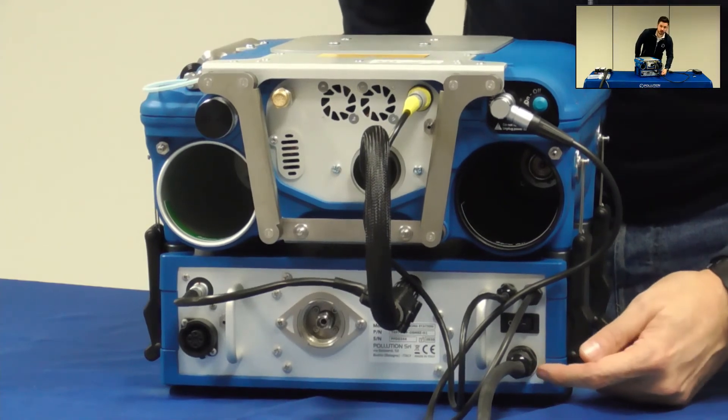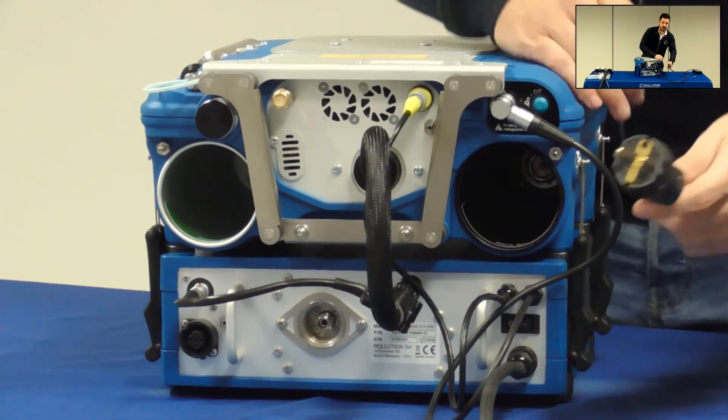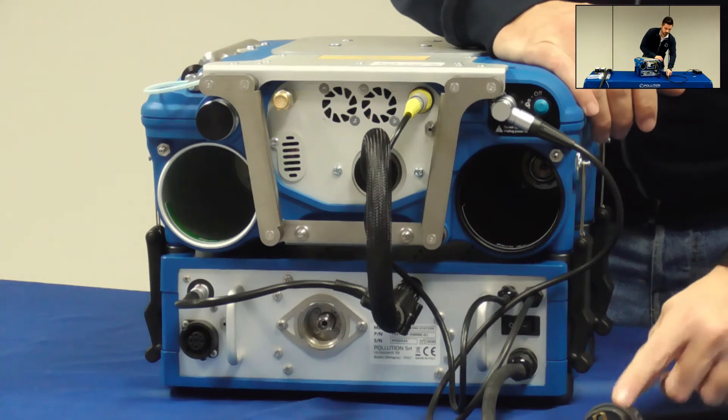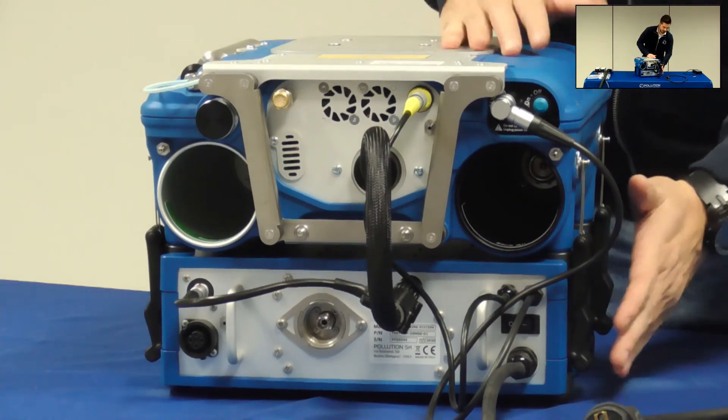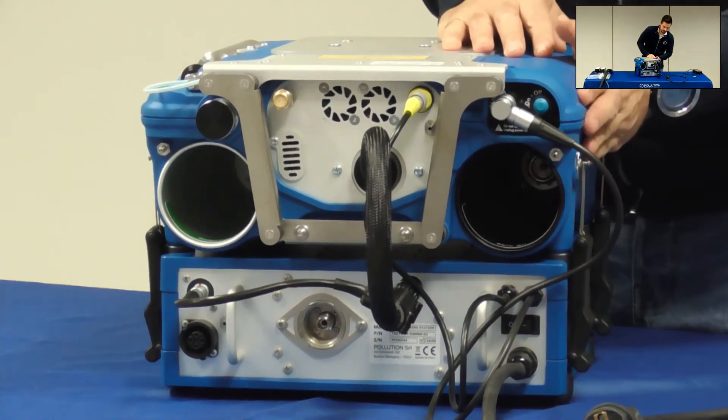Here on the left bottom side there is the power cable that will give electricity to the whole system. So electricity to docking, to Polaris and to the sampling line.